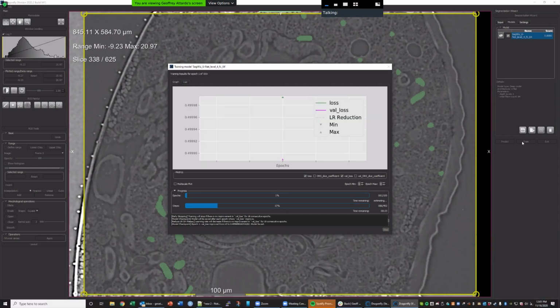So the numbers that I'm seeing, is that like the prediction accuracy? It's roughly 50%. It's not exactly the accuracy of the prediction. What do you see, the number here? I think it's the loss function. The accuracy is not shown here. If you see my mouse, if you check here, the dice coefficient, this is more about the accuracy of the prediction.